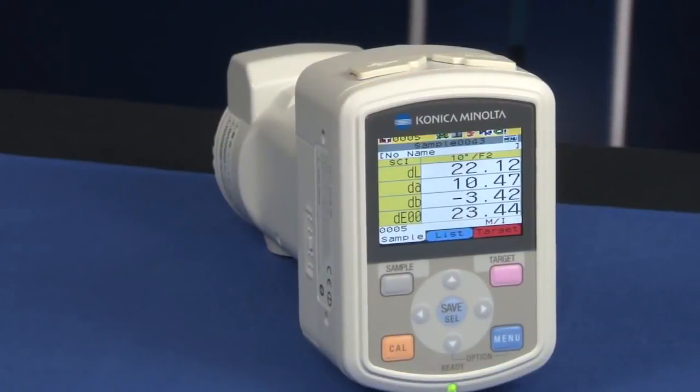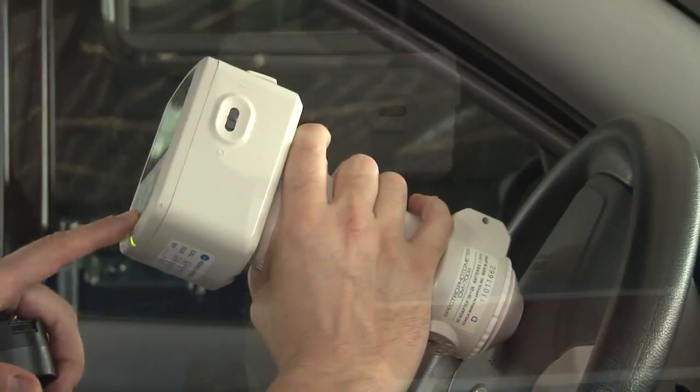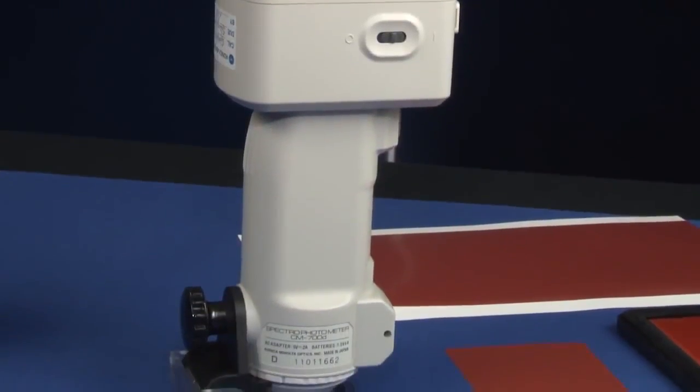Inspect, sort, select, classify, or grade your product anywhere with Konica Minolta's CM700D Spectrophotometer.